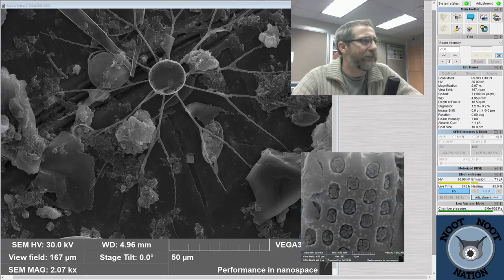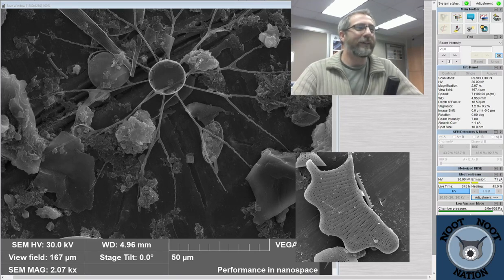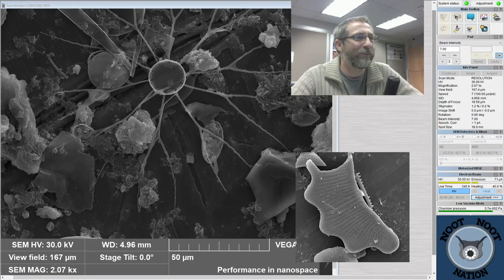Can do micro shavings and look at seasonal weather fluctuations in ancient times. Yes. So, Pacific Plankton's all over it. Yeah, that's it. Bacteriastrum. Yeah, it's a really pretty diatom, and it makes that super cool pattern.